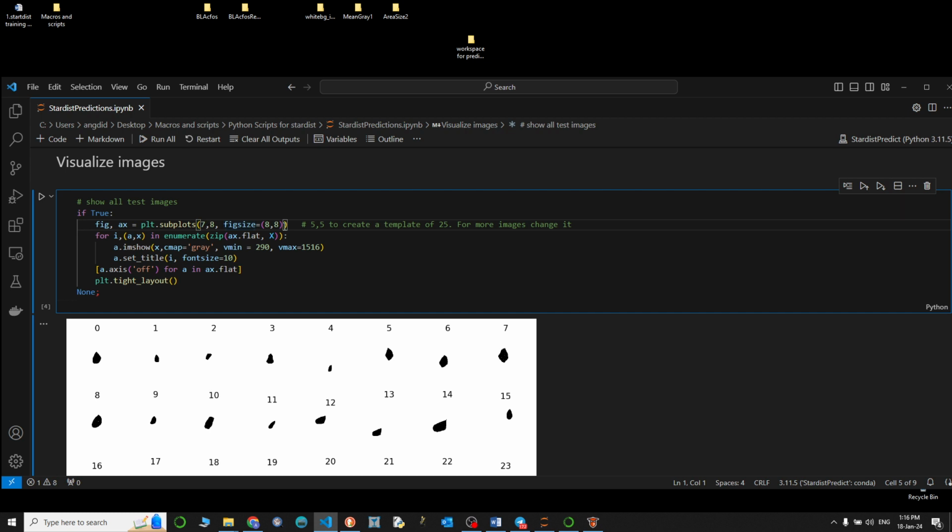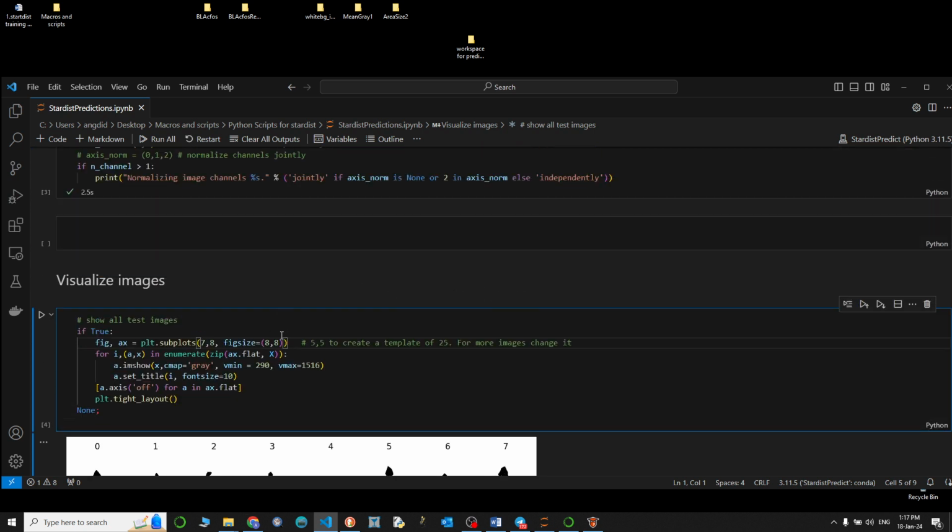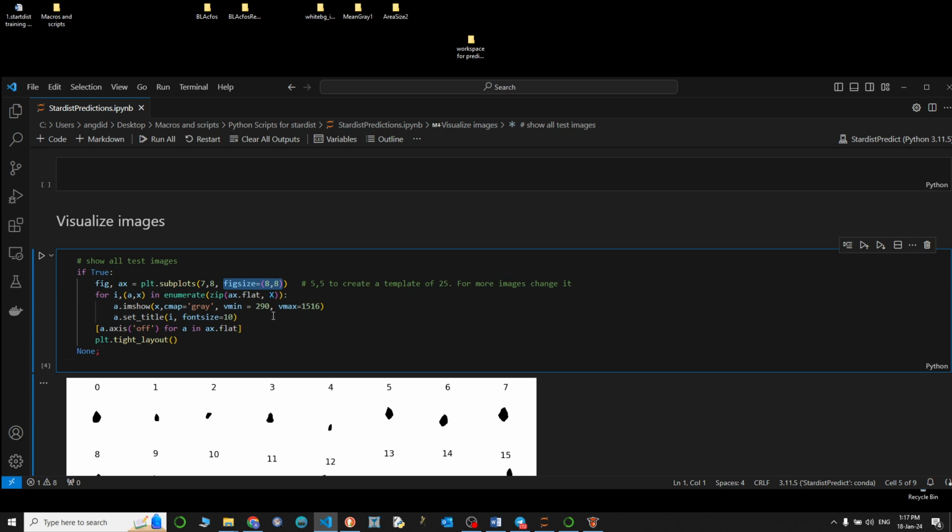I don't know if it matters, but what I know for sure is that sometimes our kernel dies when we run this kind of analysis. And I suspect that it has to do something with the memory. So I just reduce the figure size every time in case it alleviates, in a sense, anything related to the RAM. I really don't have any idea how this really works, but I'm just trying to make it less heavy computationally, although it might not work just by reducing the figure size. That's for those who know better than me.